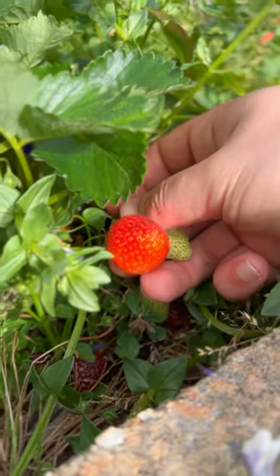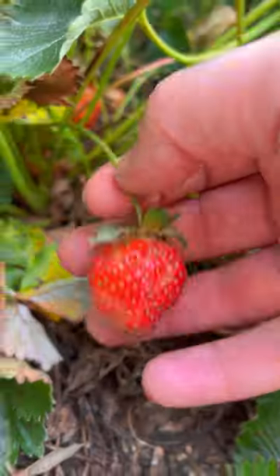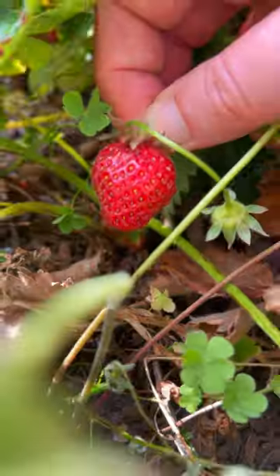This is why you should always wash your garden-picked strawberries. I picked a variety of strawberries that I have been growing, and we are going to look at them under the microscope. I was absolutely shocked when I found this, but I wasn't surprised.